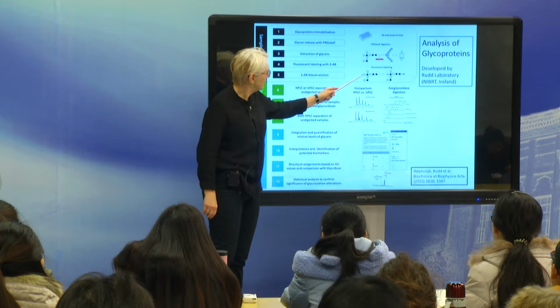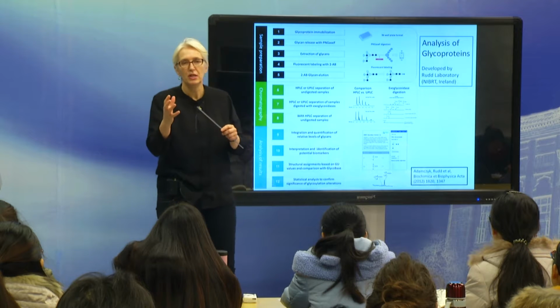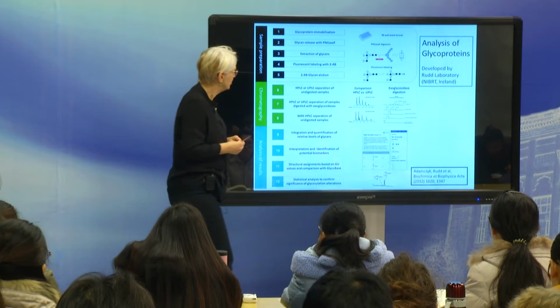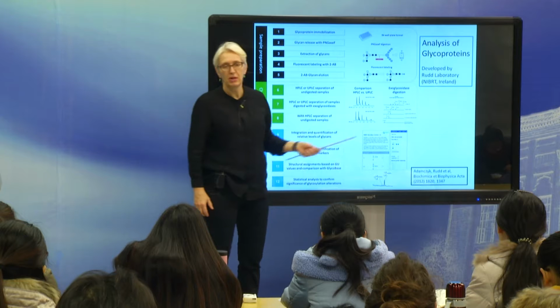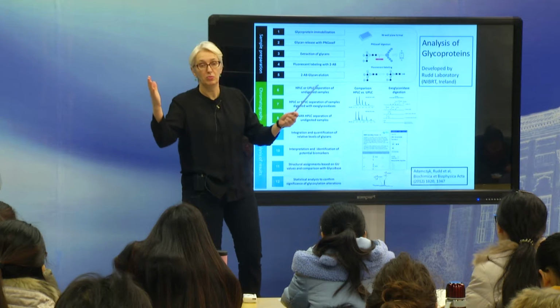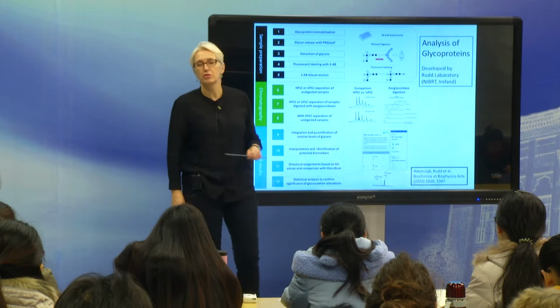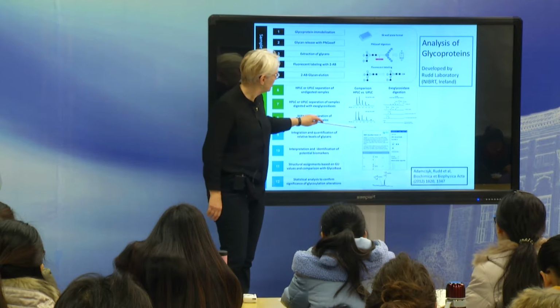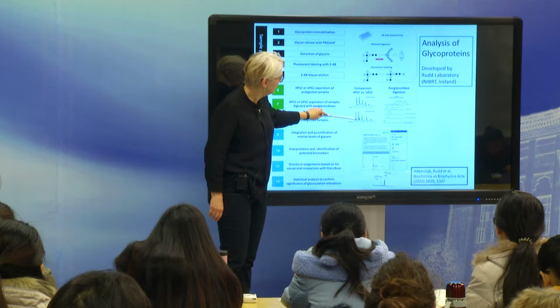It turns out that if you have these isomers, if you shift a hydroxyl group around or shift a linkage around, your LC retention pattern changes. And if you have a whole set of these glycans coming from some biological samples, where you get a whole mixture of them labeled, and you run them on LC, you basically get these forests of peaks. And this is highly optimized. So this is HPLC. You can see UPLC. You get really, really nice sharp peaks.